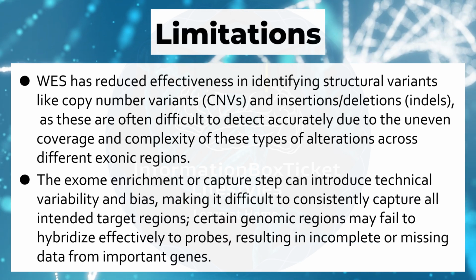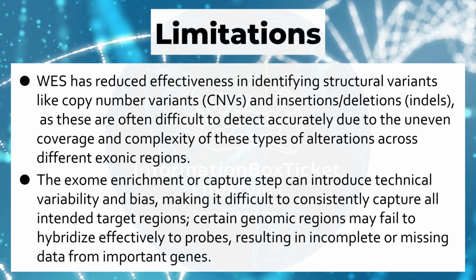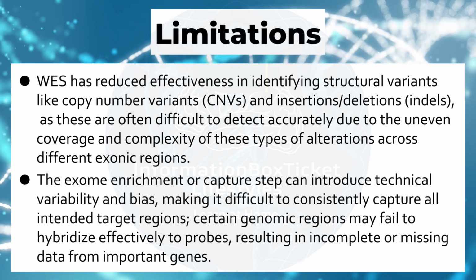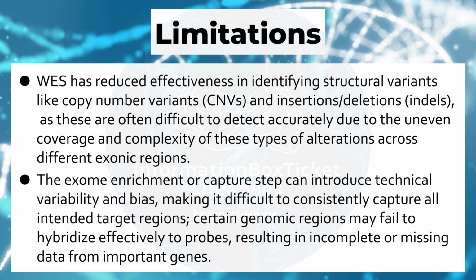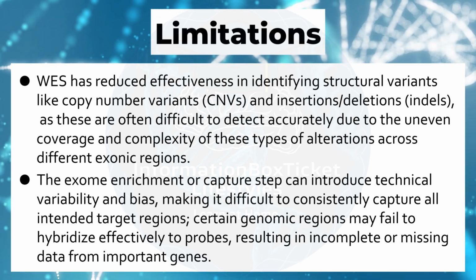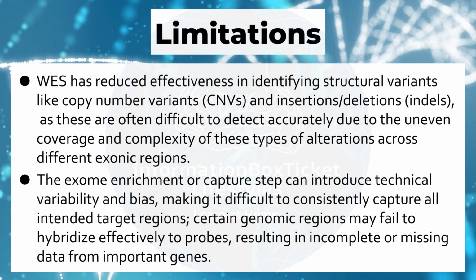The exome enrichment or capture step can introduce technical variability and bias, making it difficult to consistently capture all intended target regions. Certain genomic regions may fail to hybridize effectively to probes, resulting in incomplete or missing data from important genes.